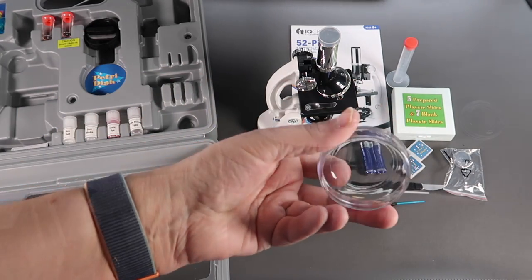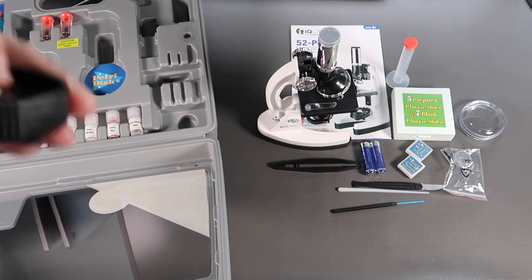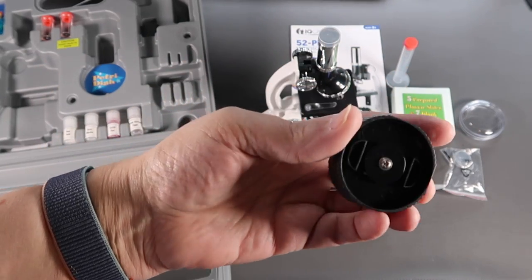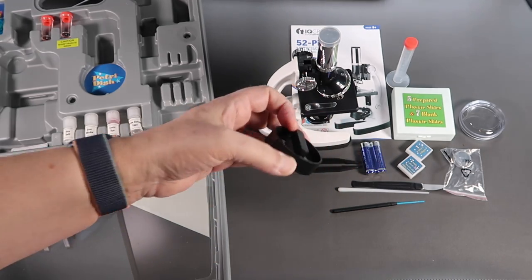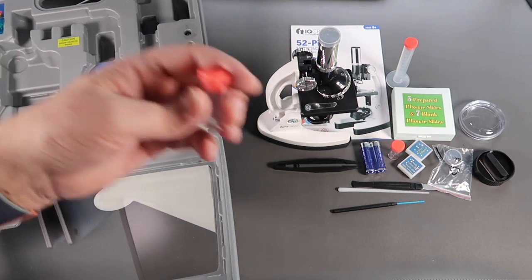Petri dish. I'm not entirely sure what this is. Two of these.